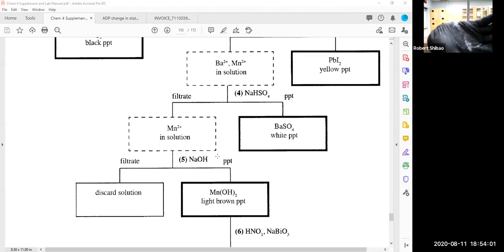You can see all the sodium hydroxide on my gloves here. That's solid sodium hydroxide. So what I'm going to do is wash off my gloves so I don't get that. You definitely don't want sodium hydroxide, especially solid, pure sodium hydroxide in your eyes. Sodium hydroxide you can buy as solid. It would be just drain cleaner, basically. And so you definitely don't want drain cleaner in your eyes. It's going to cause some severe damage.